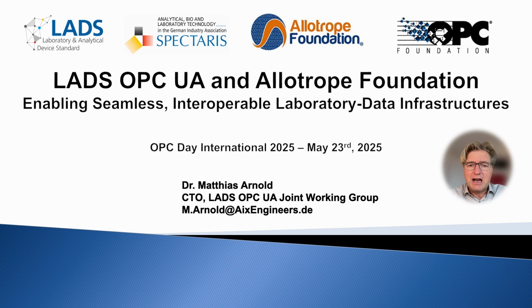To highlight how communication and data standards come together, I'll briefly introduce LADS OPC UA, the new companion specification for lab analytical devices, and show how it integrates with Allotrope Foundation technologies, enabling a harmonized, interoperable data layer that spans the full data lifecycle, from sample preparation and measurement to documentation and further processing.